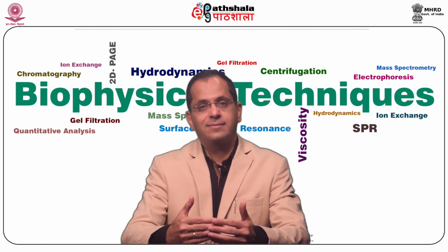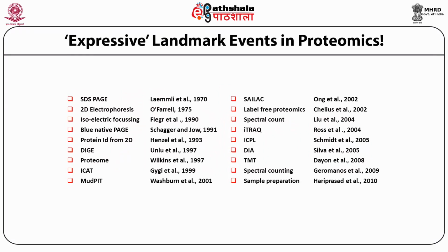Although broadly used, the term multiple reaction monitoring to indicate the parallel acquisition of multiple SRM transitions might be changed in the near future. Over the last few decades, there have been a lot of expressive landmark events in proteomics. Ever since the SDS-PAGE that was first introduced by Laemmli in the year 1970, there have been a lot of flagship research innovations in the field of proteomics. The entire list of these innovative techniques and procedures is listed in this particular slide for the use, reference and study by the students.